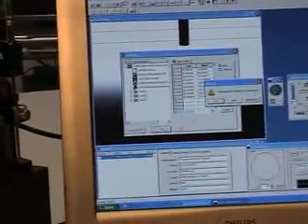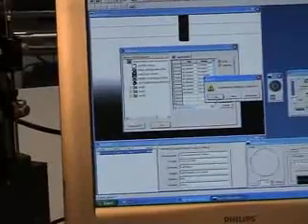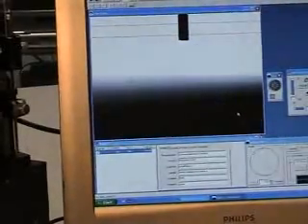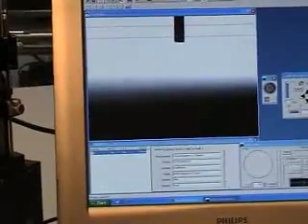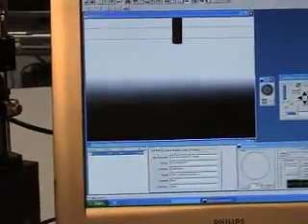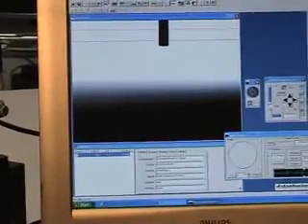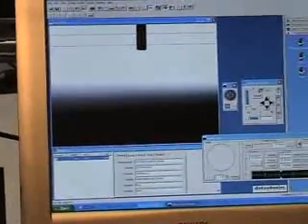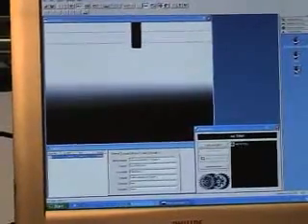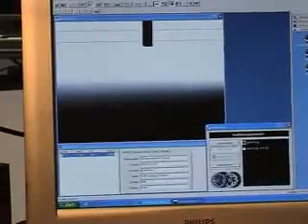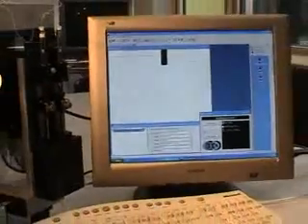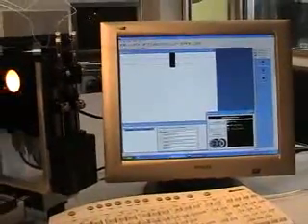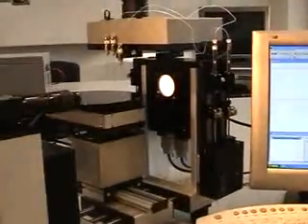So we just press OK and now the definition of the measurement will control our instrument.